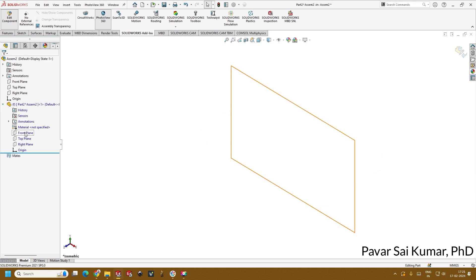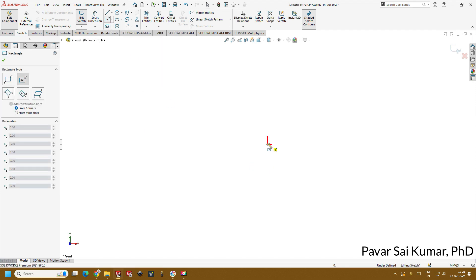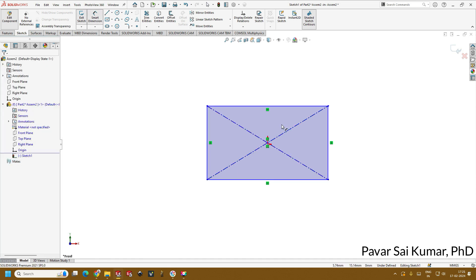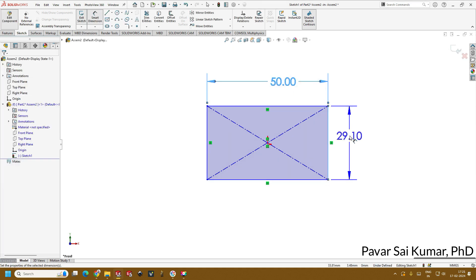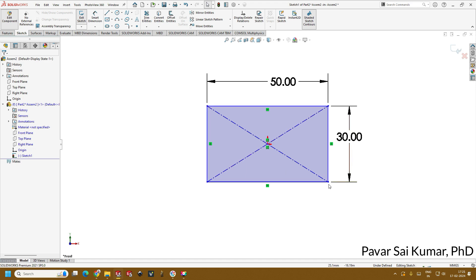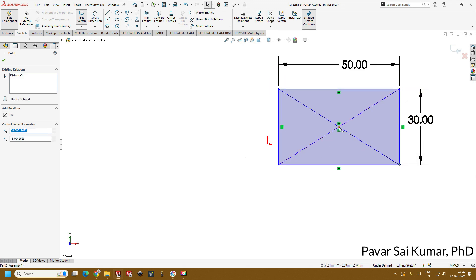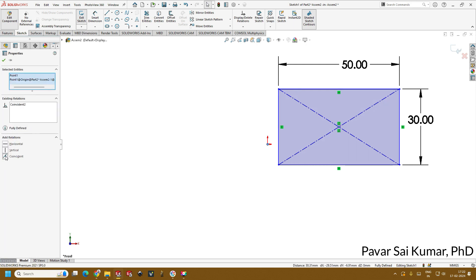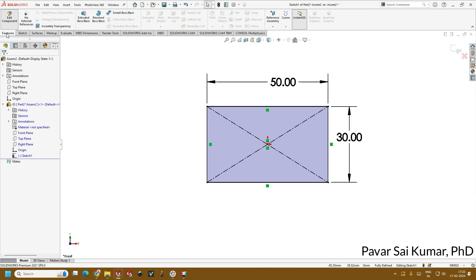Now you are in the part within the assembly. I'll just change the background color to plain white so it looks better for viewing. Select a plane — I am choosing the front plane — and then take a rectangle, just drag it. In the smart dimensions I will give something around 50 mm and this is around 30 mm. These are arbitrary units that you can adjust depending on your application. Notice it is not fully defined — click here and hold control, select the origin, and create a coincident relation. Now it is fully constrained.